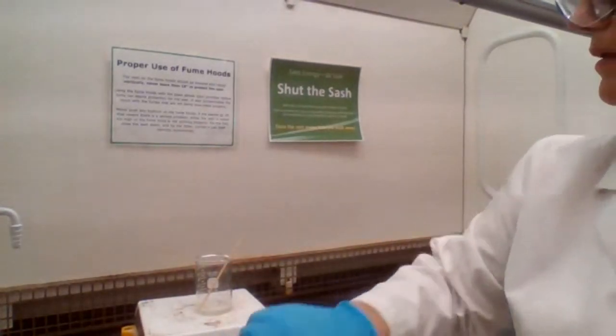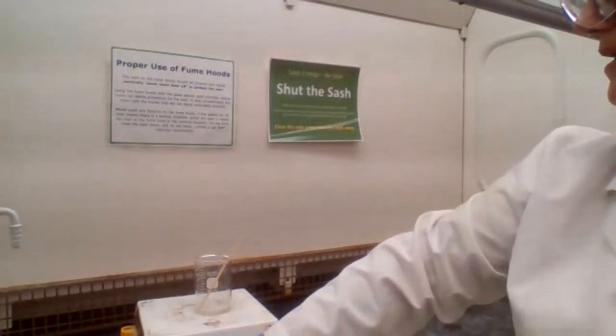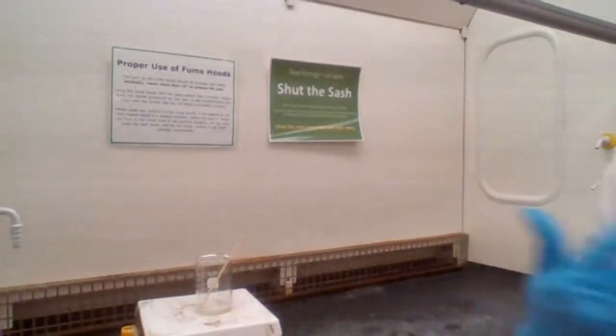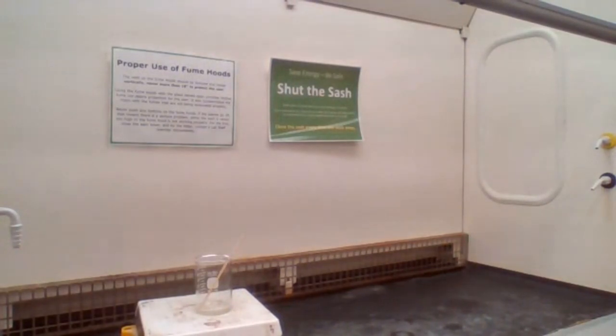And since it's in the procedure and you're not here, I'm going to also bring a thermometer and check the temperature. If the temperature goes higher than 50, I can stop.